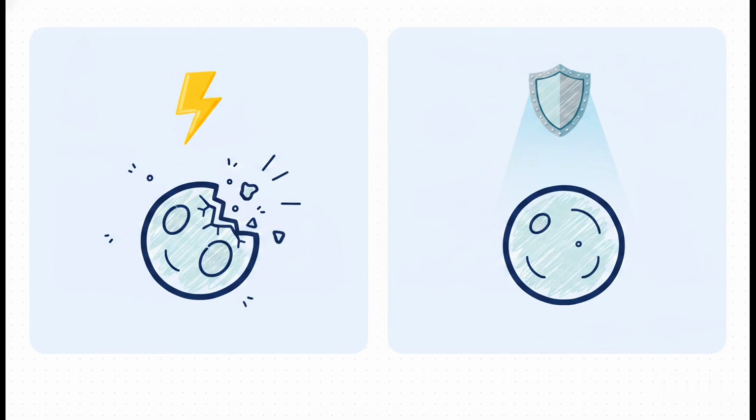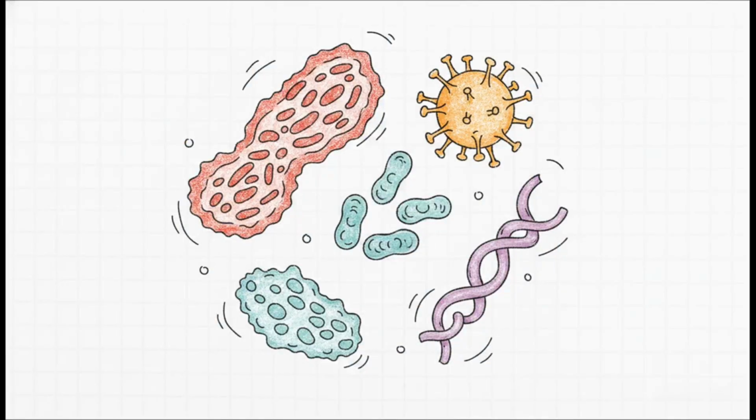The absolute secret sauce of the FESEM is its low-voltage imaging capability. This allows researchers to perform safe, high-resolution analysis of highly sensitive organic samples without blasting them into oblivion with heavy radiation damage. Because of that crucial low-voltage capability, the FESEM is a total game-changer for biological research.